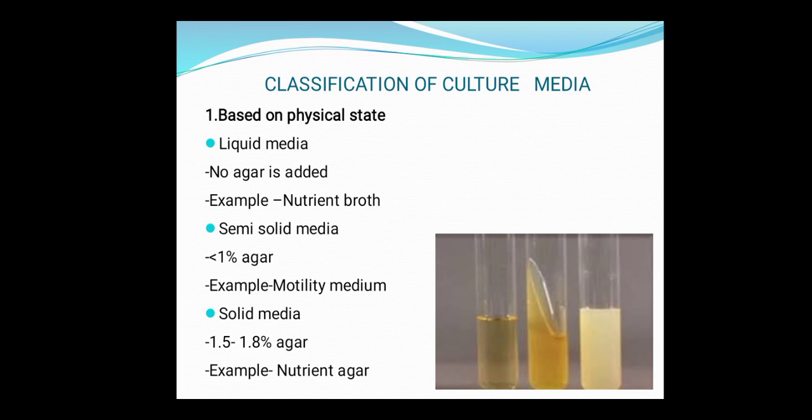Thirdly, we have the solid media. These solid media are somewhat less sensitive than liquid media, and they are mainly used in petri dishes as plate culture, and sometimes in bottles or tubes as butt or slope culture. The main purpose of culturing in this solid media is to isolate single colonies or discrete colonies. For example, we have nutrient agar, which is one of the simplest and most commonly used media in the laboratory.